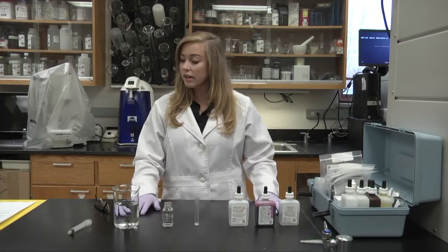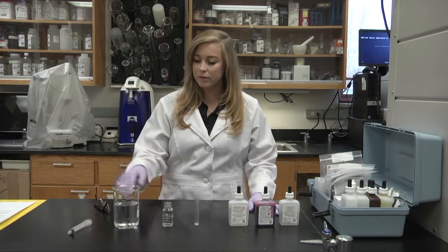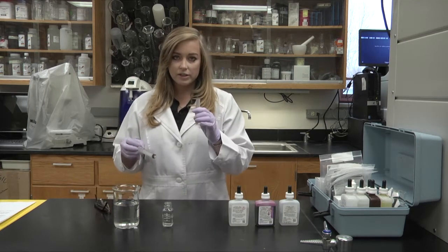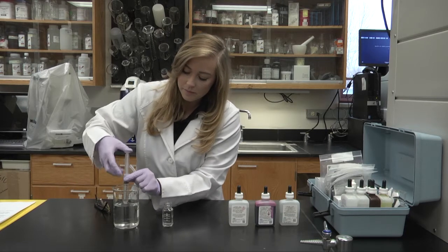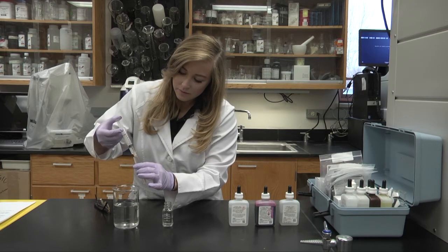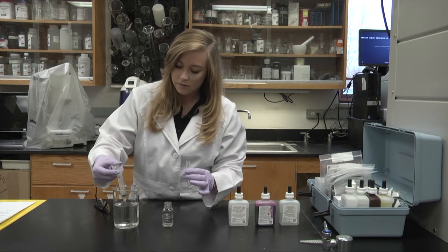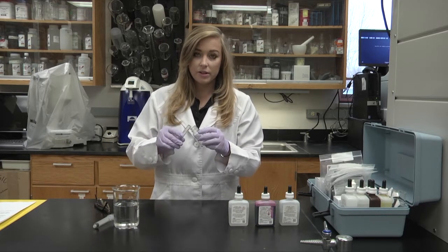First off, we're going to do hardness. Hardness is the amount of calcium and magnesium found in the water. We'll take our plastic tube and fill it full of water, then put it in our mixing bottle.